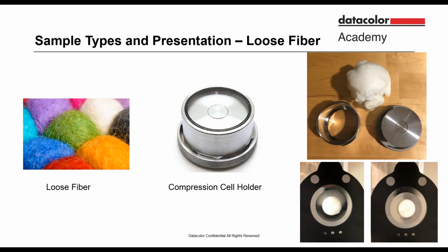For samples like loose fiber, we also face the same issue, protrusion in the sphere. We are also challenged by the fact that the pressure applied in the sample holder will vary depending on the user. So for these, we recommend using a compression cell holder.